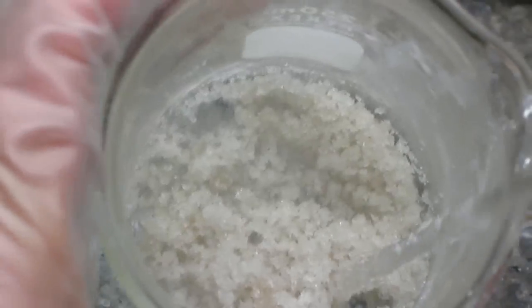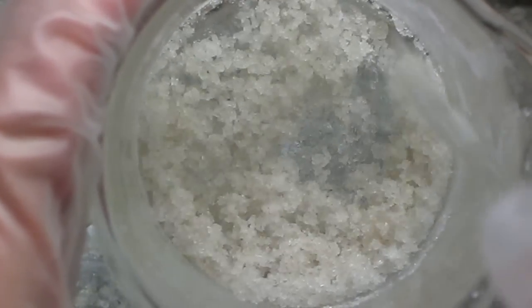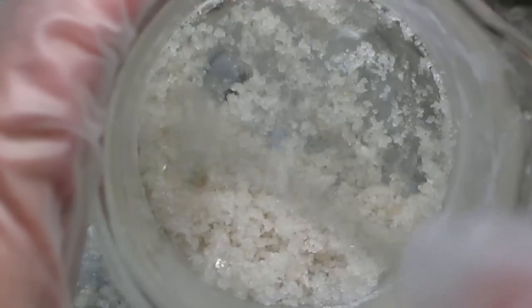Eventually you'll have crude aluminum nitrate nonahydrate. It's not pure enough for our purposes but we'll show purification techniques in an upcoming video.